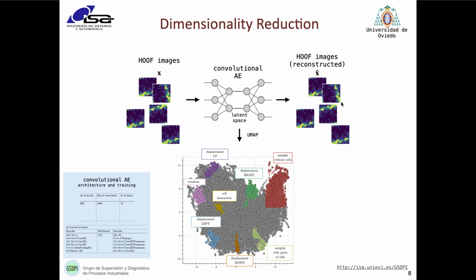Using a 2D convolutional architecture on the HOOF images, we can efficiently model the spatial coherence and shift invariances in this representation, so we proposed a convolutional autoencoder to model the HOOF images of many small 75 by 75 by 16 videos taken from the original ones, trying several configurations. The resulting latent space happened to reveal meaningful groupings of cell motility patterns.